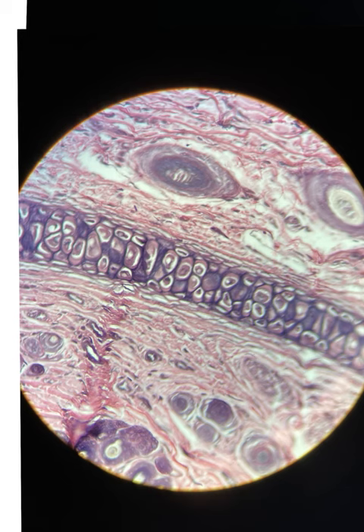Okay, so this is cartilage. And this is a specific type of cartilage called elastic cartilage. And you can see the chondrocytes here, and these elastic cartilages allow for tissues to return to their normal shape. So instead of just pressing on your skin or something and then it just staying that way, you have elastic cartilage. Another place that this is found is the epiglottis.